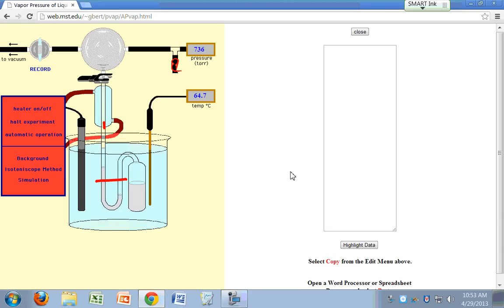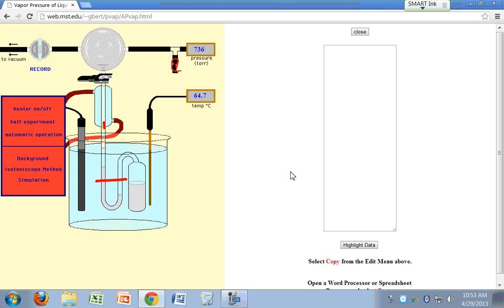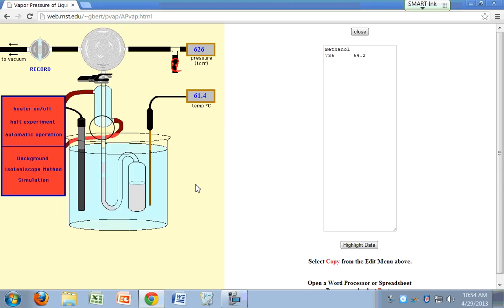Look, the thing is dropping. I just hit the space bar, and then any key will pump it back up, and then wait for it to settle down again. And then once the liquid levels are the same, hit the space bar again.